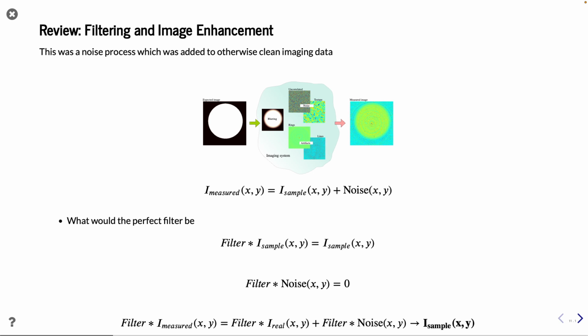We already saw in the last lecture that images are usually not really what we expect them to be, so they are noisy and they have artifacts. And in the end, we have to do some processing steps, and these steps hopefully make it easier to segment the image.